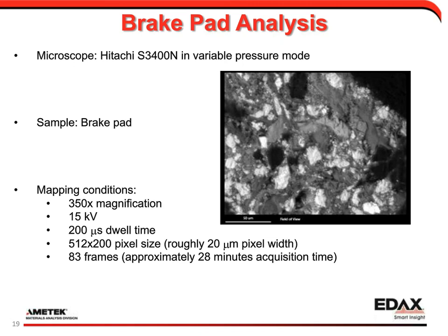I have done EDS acquisition down to, I think the lowest I've done is about 500 volts. And we can still get signal in those ranges, but you're quite limited in what you can see. Basically, it will be carbon and nitrogen.